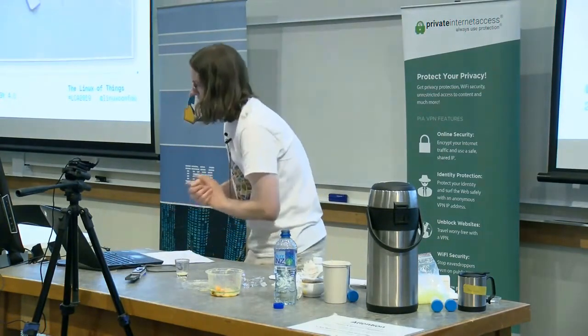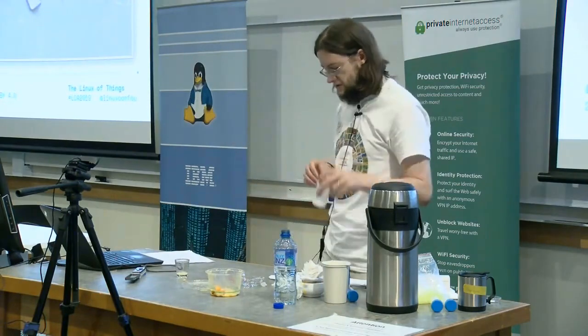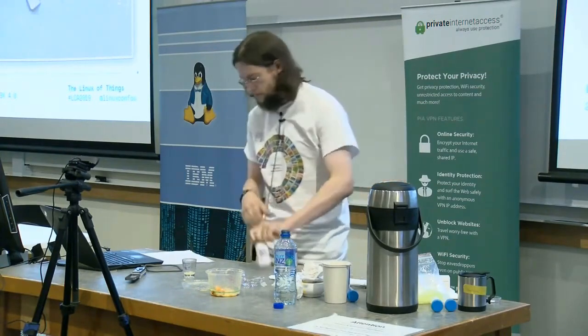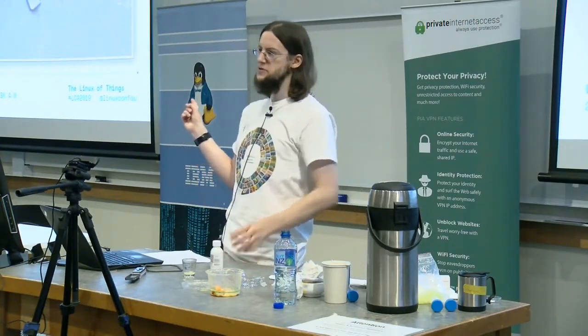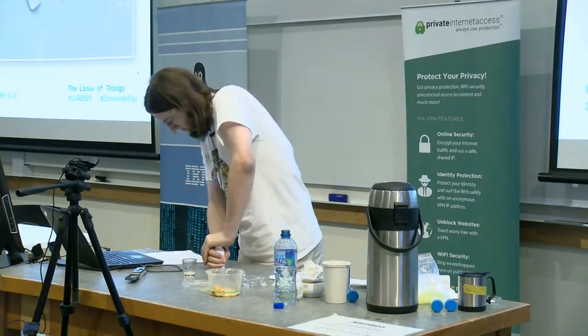Okay, so now the next step is to use some methylated spirits. Now DNA, as I said, dissolves in water, but you can use high concentration alcohol to sort of scare it out. So this is some methylated spirits that I bought at the pharmacy here. I was a bit too scared bringing alcohol along on the plane, so I decided to buy it here in Christchurch.